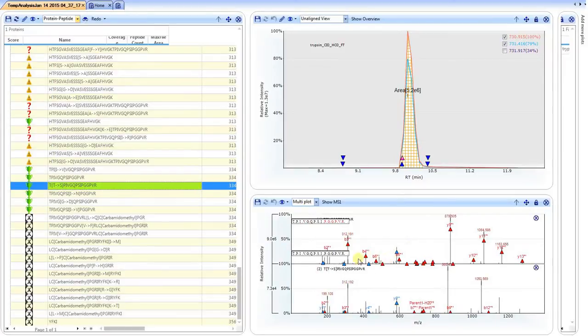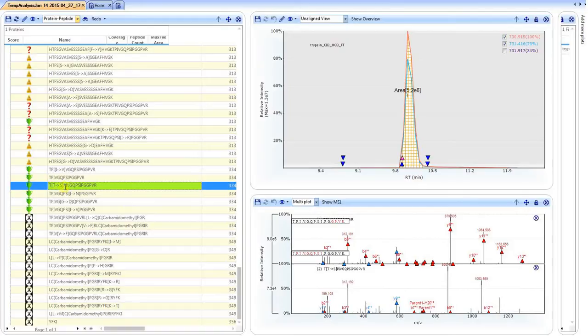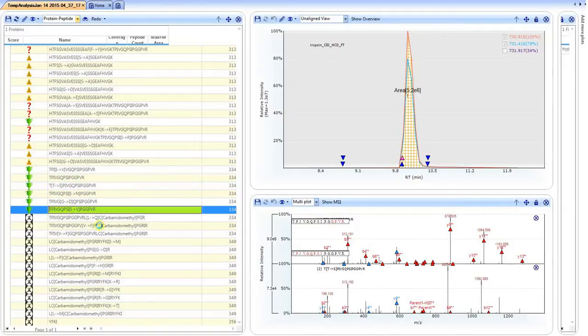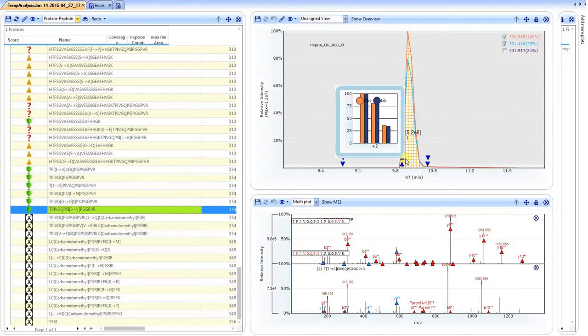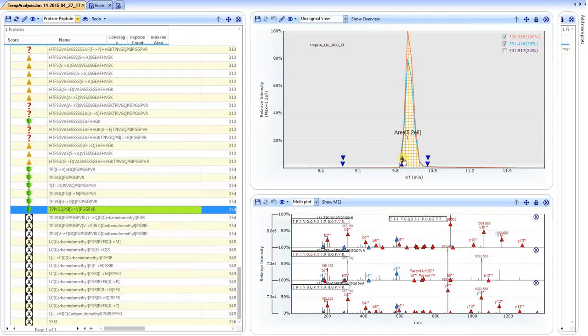The blue triangles represent common fragment ions observed between both product ion mass spectra, and the red triangles represent those fragment ions that are unique. The matching at this particular site of modification, which is at the N-terminus, doesn't appear to line up as well as if we would click on the isoleucine to valine and add yet another product ion spectrum.